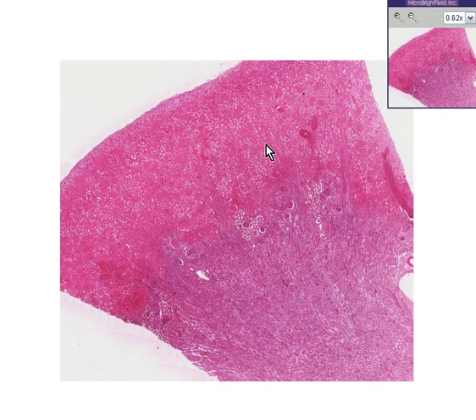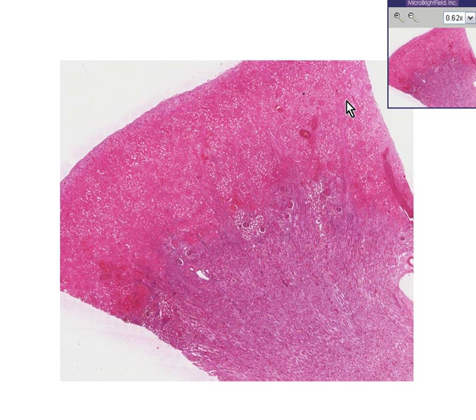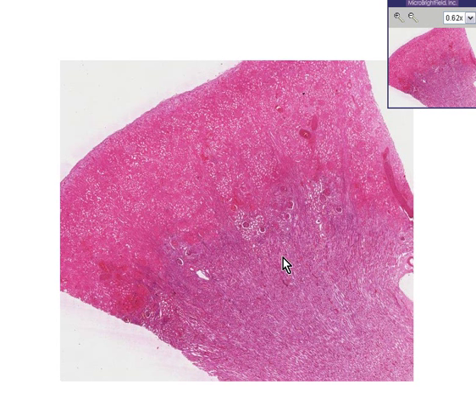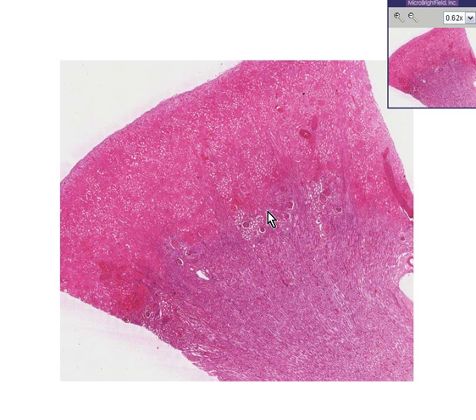Here is another kidney. Notice there appears to be a much redder zone more peripherally in the cortex and a more bluish zone towards the center portion of the kidney. And here is generally the area of demarcation between the two.